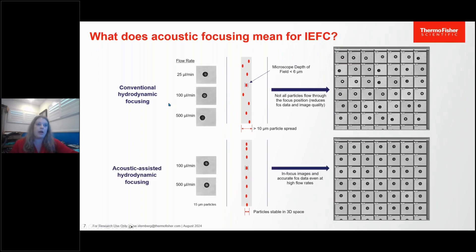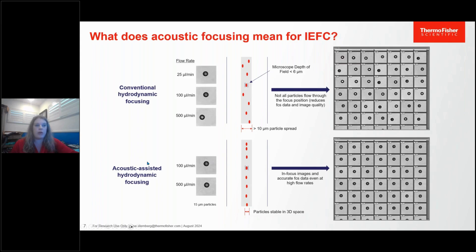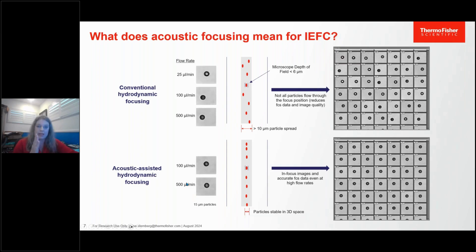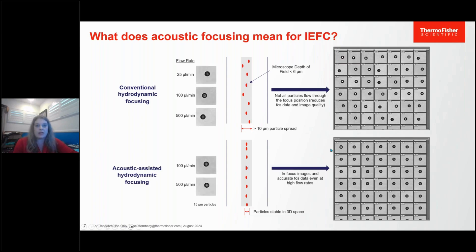When we turn on our acoustic focusing, it centers the cells in the stream very nicely. Whether we run our sample at 100 microliters per minute or 500 microliters per minute, we get a very steady cell in the middle of our field of vision, which means we can get very high-resolution images where we can see not just the outside of the cell, but also some subcellular features.